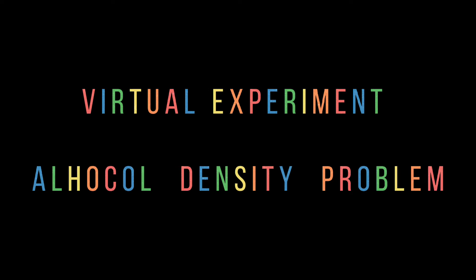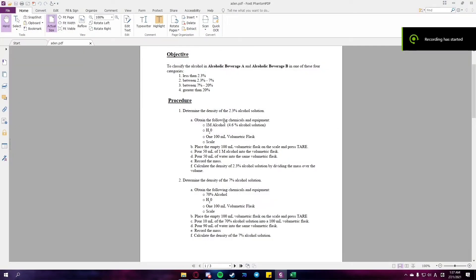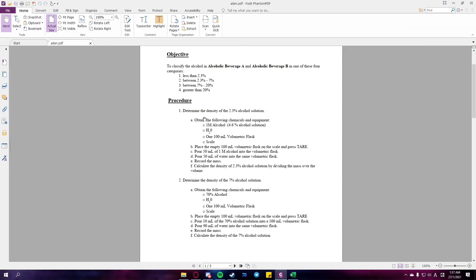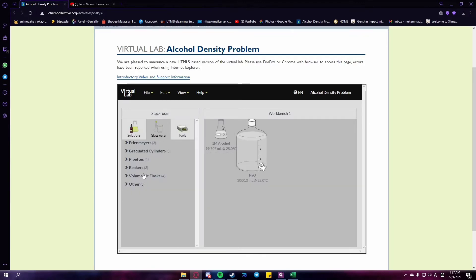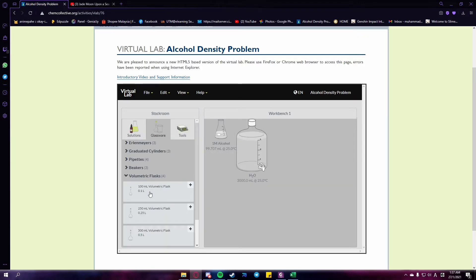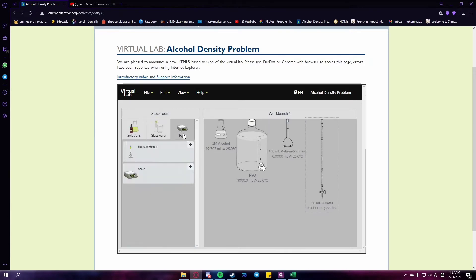The topic of our virtual experiment today is the alcohol density problem — determining the percentage of alcohol in beverages. The objective of this experiment is to classify the alcohol in alcoholic beverage A and alcoholic beverage B into one of these categories: less than 2.3%, between 2.3% to 7%, between 7% to 20%, or greater than 20%.